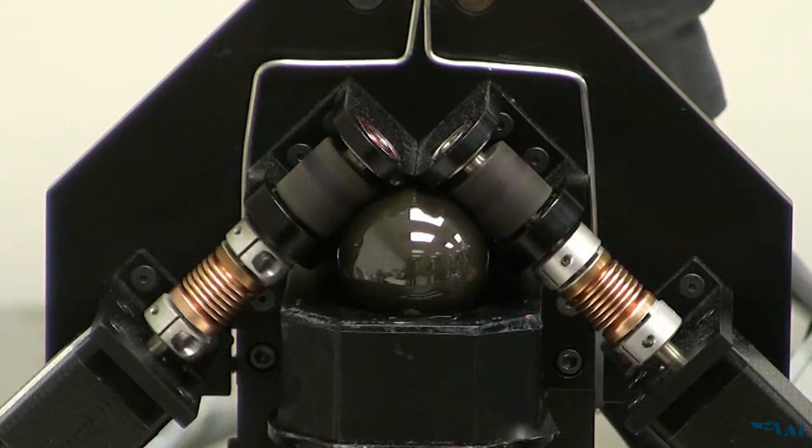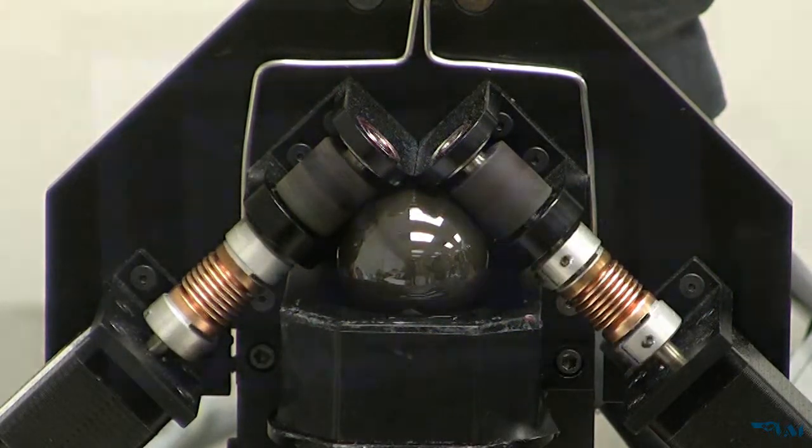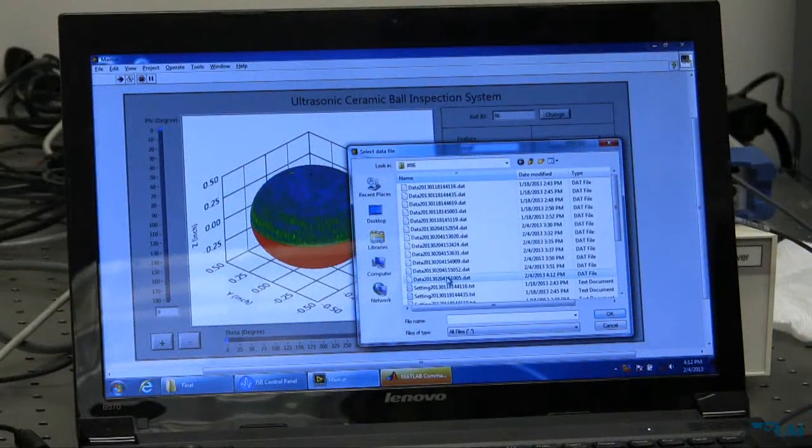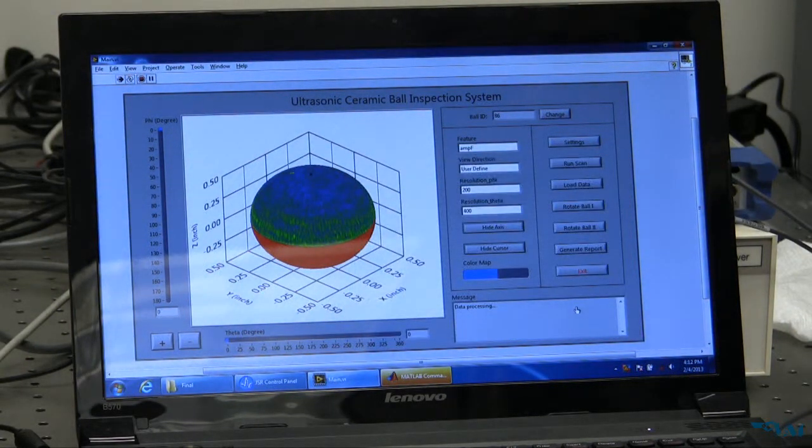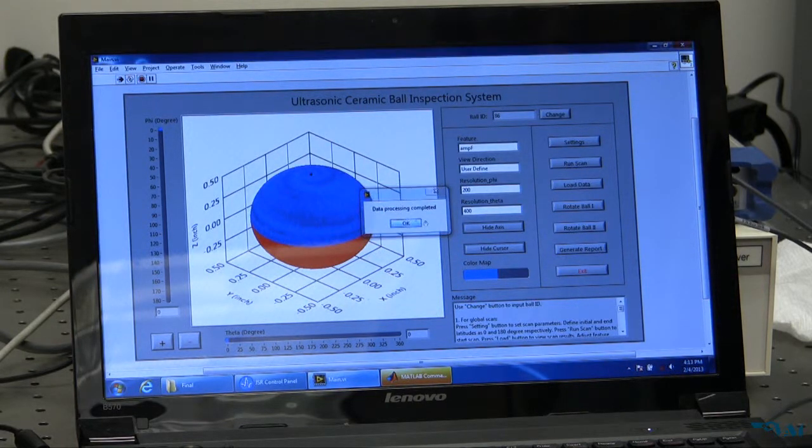The ball is driven by two friction wheels along a spiral trajectory. When the scan is completed, click the Load Data button and select the raw data file to perform signal processing. A 3D image of the scanned region is shown in the main interface.